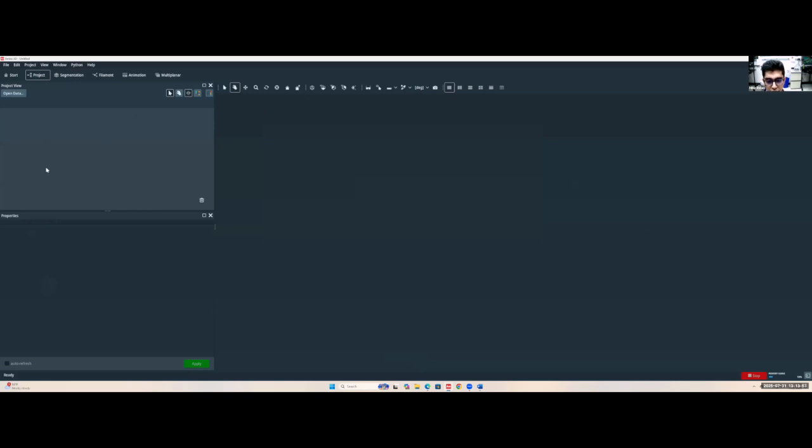So the first thing we want to do is import our files that we segmented from membrane and TARDIS. We want to use both of them, and I'll go into a bit more detail why after, for our DRG segmentation. Note that this is going to be specific to the DRG segmentations and segmenting a full cell volume, but it's not always necessary that you're going to need both files. It's kind of dependent on what it is you want to segment.